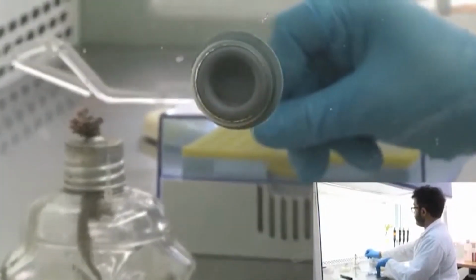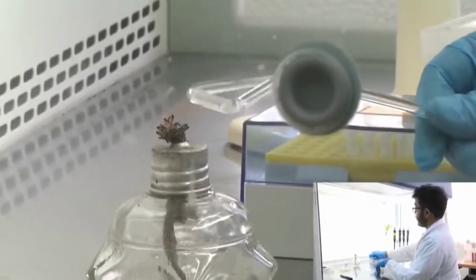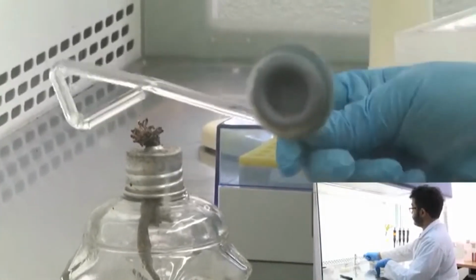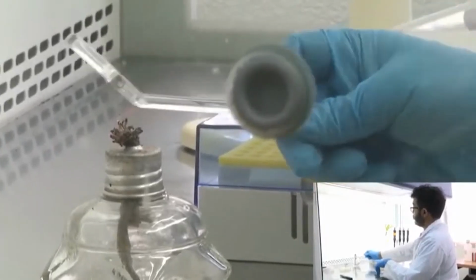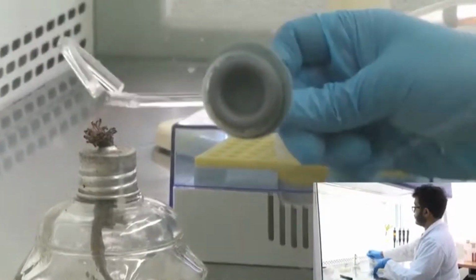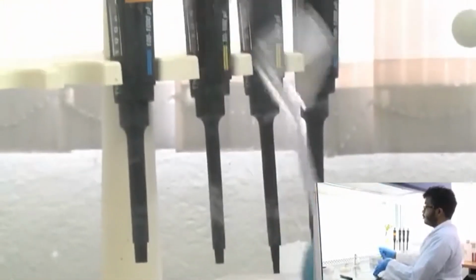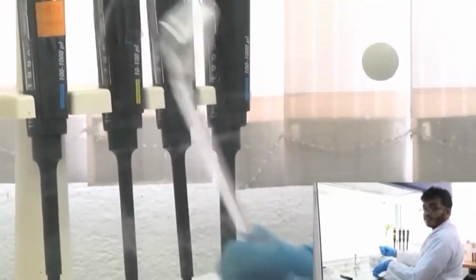So I'm again reheating the surface sterilized glass spreader, and once the ethanol has been burnt off, I'm satisfied that there is no residual ethanol left. What I'm going to do is again cool it. If it's too hot, it's going to kill my bacteria, and if bacteria are dead, you cannot get any colonies. There's nothing left to grow, right? So now I'm just going to cool it quickly. A rule of thumb is to keep it like this for maybe around 60 seconds, close to a minute.